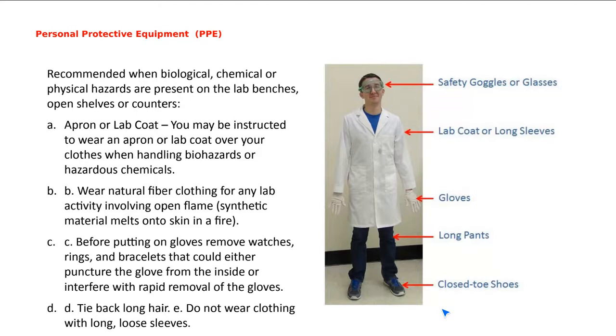The other thing you'll have to do is if your hair is longer, you'll have to put it back so that it's tied back away from your face and it will not fall into an experiment when you're working in the lab. Okay, so be sure you have a hair tie or a barrette or whatever it is that you will wear your hair back with. Okay, good. Anybody have any questions?